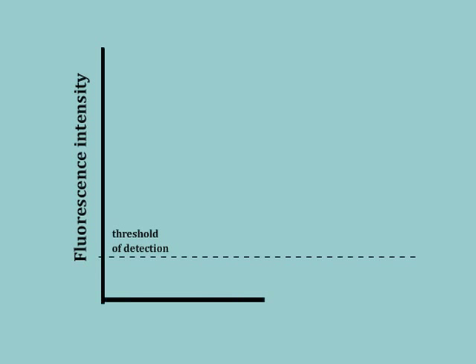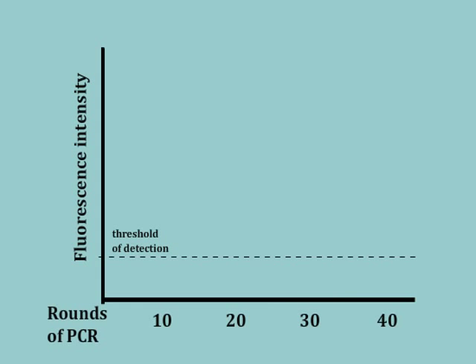So, if you begin with a clinical sample that had only one copy of the target DNA, it could take 40 or more cycles before the amplicons are detected by a fluorometer in a specialized thermocycler. However, if the original sample contained 32 times more copies of the target DNA, then the fluorometric detection would occur after 5 fewer rounds of PCR.